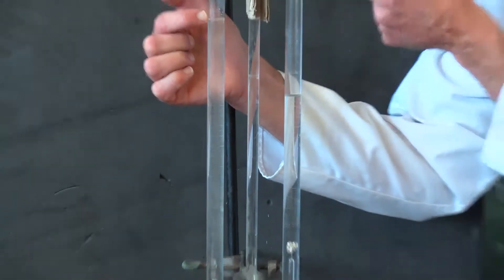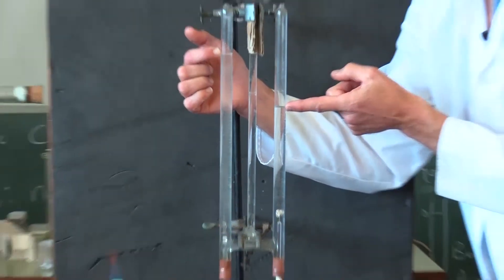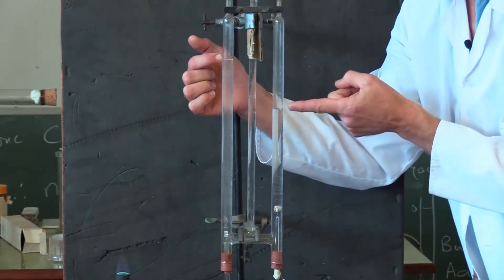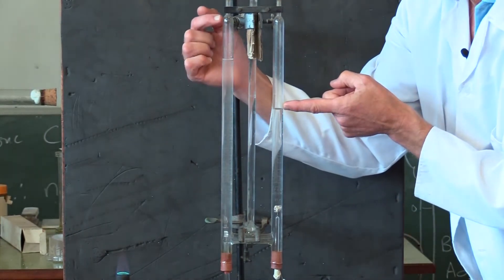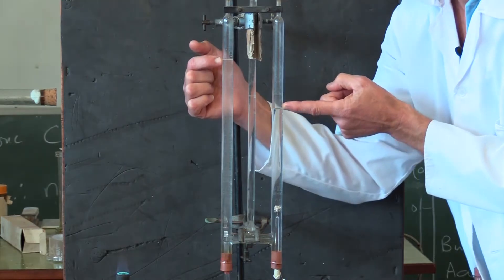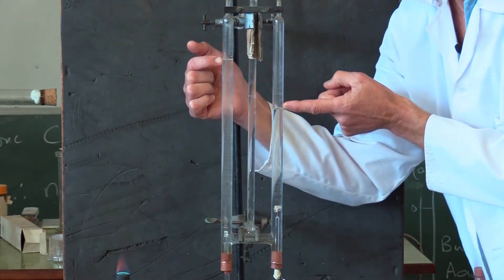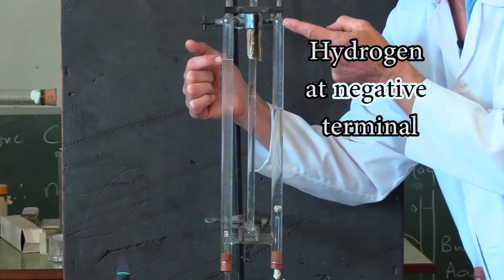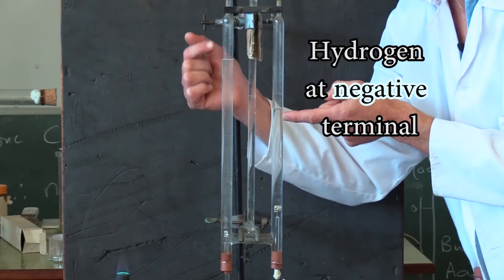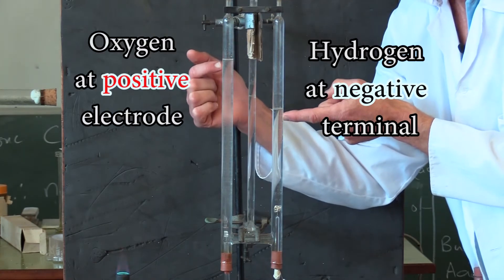We've had enough gas to push this one down to there, and that's at the negative electrode. And we've had on the other side half that amount. And if you remember the formula of water being H2O, clearly this is hydrogen, and there's twice as much as the oxygen on the other side.